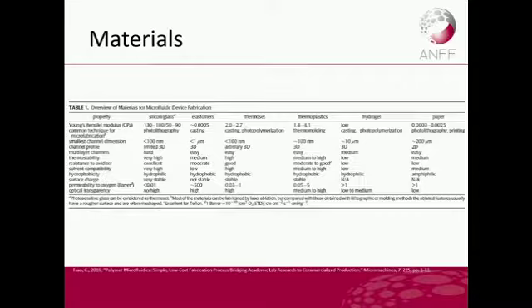This is a table showing some of the properties of the materials that we just looked at. I'll focus more on the elastomer at this stage, because the next talk will be on soft lithography, and that is the key material in the process. Basically it's easy to use, and you can generate 3D structures with it. It's soft though, so it's a low Young's modulus material. The drawback is that it's probably hydrophobic, but I'll talk more about the surface treatments that you can do on the PDMS to change that.